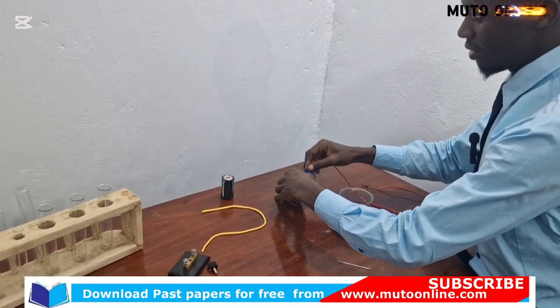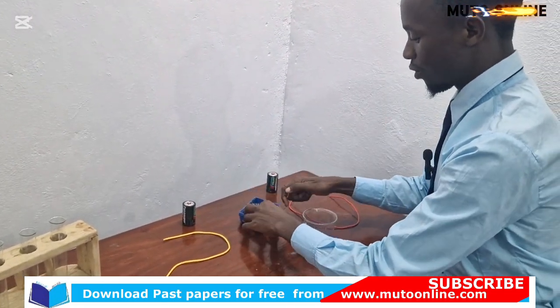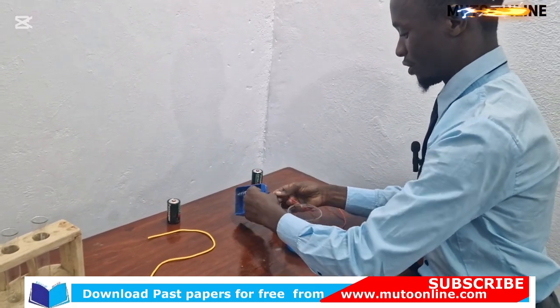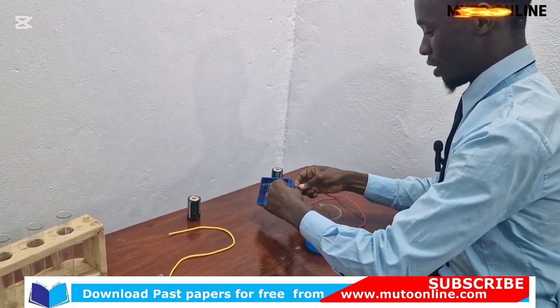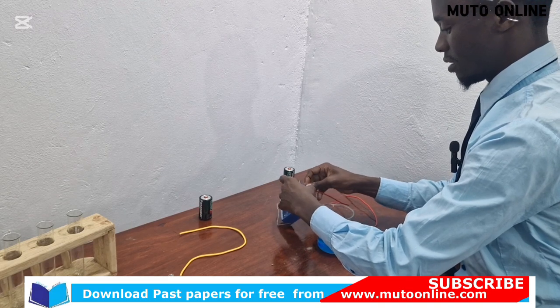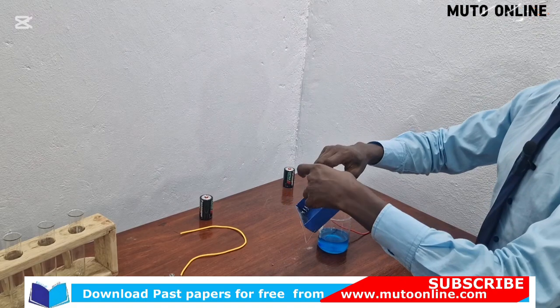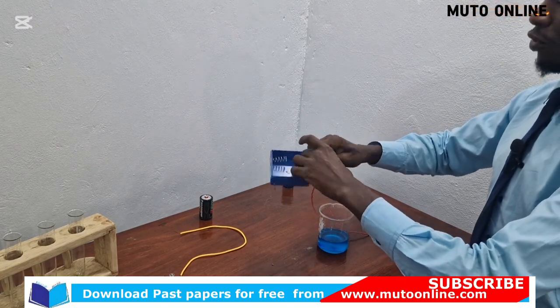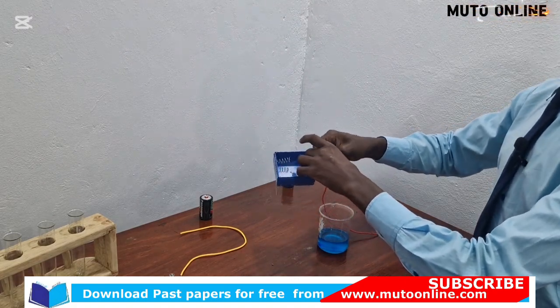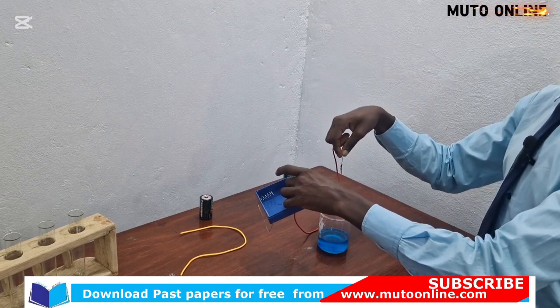We want to really see, is it real or are they just narrating us stories? So I'm going to use my copper as my active anode to check whether this wire is purely made of copper. And if it is made up of purely copper, this part of the wire will dissolve in the electrolyte.